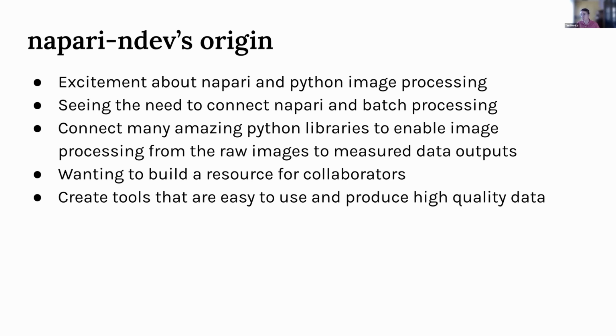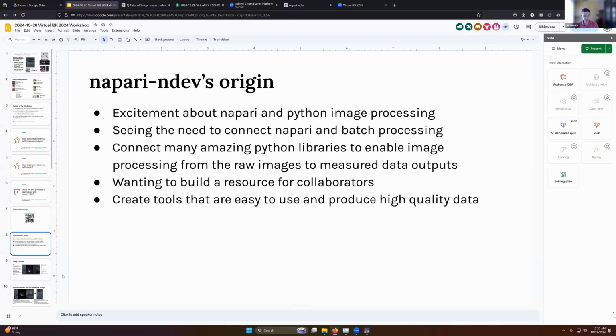If you want to contribute to this plugin too, I'm happy to have other contributors join as well. I wanted to build a resource specifically for collaborators. And really my goal is, I'm not kidding, that a brand new undergraduate trainee with no experience can do image analysis with this tool. That is the goal. So we want to create tools that are easy to use and then in the end can produce high quality data.